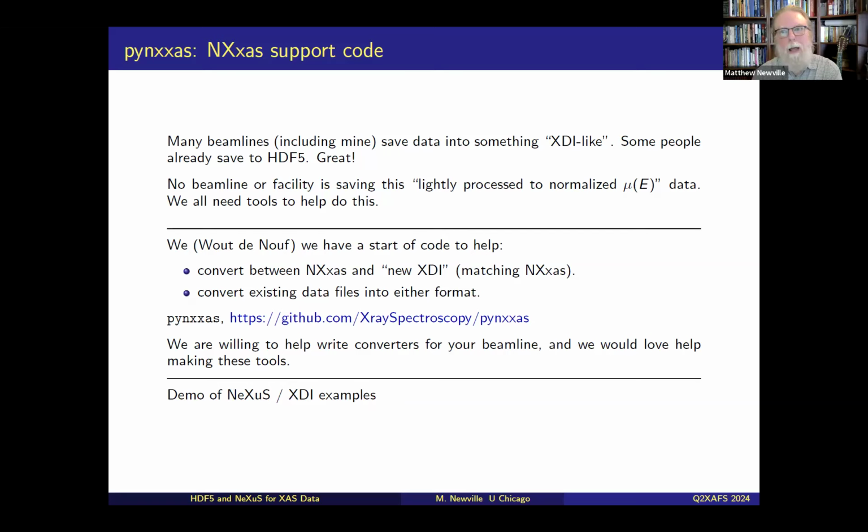I think that having a dictionary of the kind that you presented to our group is very useful to say, here's a guideline of what we want to call things. But I also think we could say that we want to have a pre-processing or a validator. Like if you're uploading this XRF spectra and it doesn't have the element name in it, or you can't tell what edge it was, that's a problem. But if you can't tell what the sample CAS number was, maybe that's something that we just say, do you have that? Because again, some people won't. Right. Yeah. Okay. Thank you.